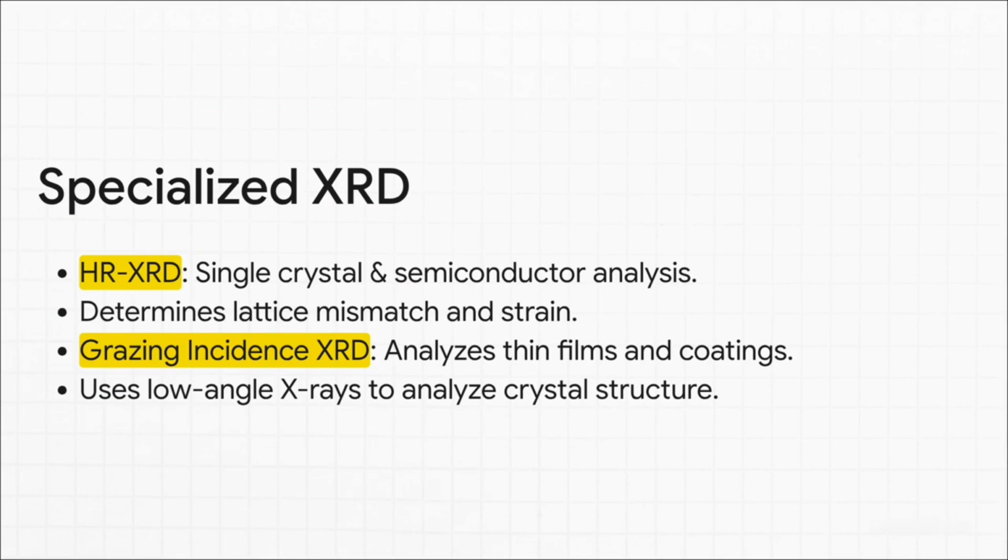Take high-resolution XRD, or HR-XRD, for example. This is absolutely critical for the modern tech world. It analyzes single crystals, semiconductor wafers, and epitaxial layers, hunting for microscopic lattice mismatches or strain. Honestly, this is the exact tech that allows us to manufacture the flawless microchips inside the computers and phones we use every single day. Then you've got Grazing Incidence XRD.